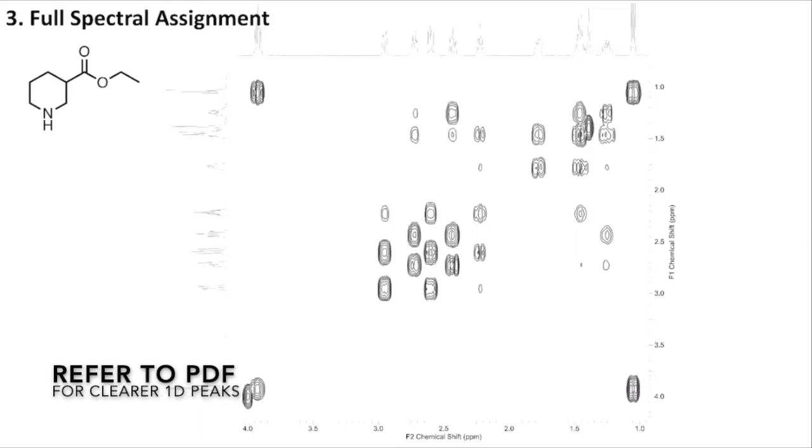There's kind of a lot of cross peaks going on here, so let's start as we always do by putting in our labels and putting in our identity diagonal to hopefully help minimize a little bit of the massive things that we have going on here. So always starting with our assignment labels on our protons just so that we can see what's what.